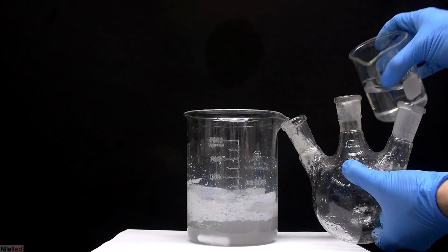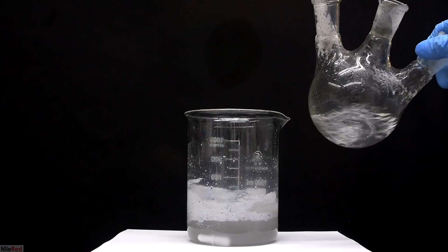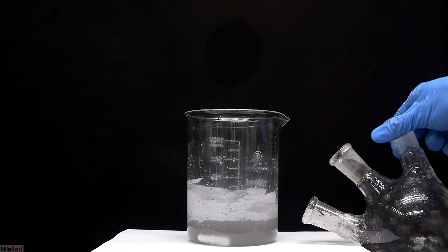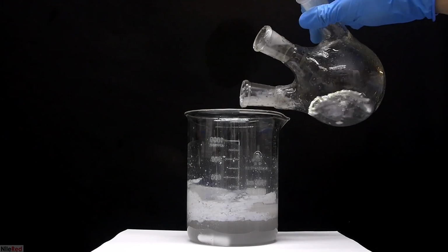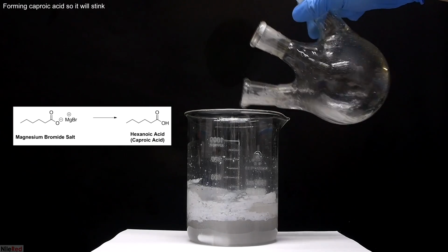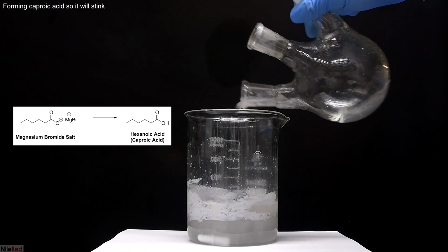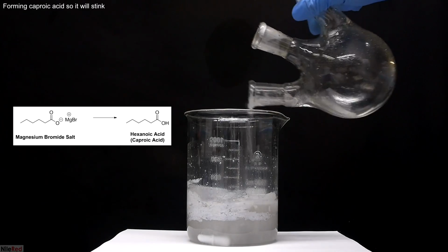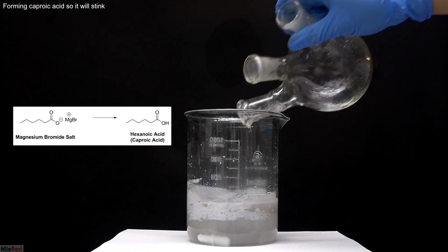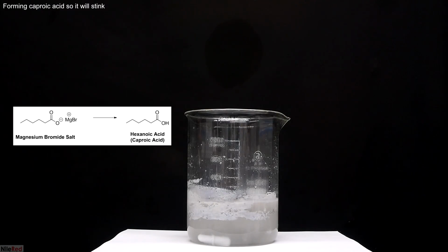As I continue with the washings, you can see that the amount of the white precipitate in the beaker seems to also decrease. I'm using the hydrochloric acid here as a washing step, but it's actually a very important step in the reaction. As I mentioned before, the white precipitate is the magnesium bromide salt of our final product. When the magnesium bromide salt is exposed to acid and water, it gets hydrolyzed, and this forms our final caproic acid. The caproic acid that's formed is slightly soluble in water and quite soluble in ether.